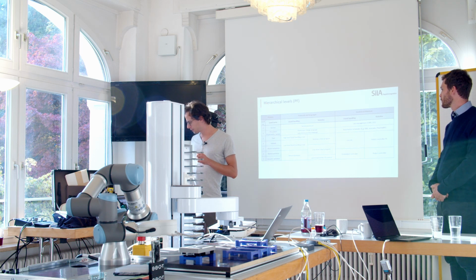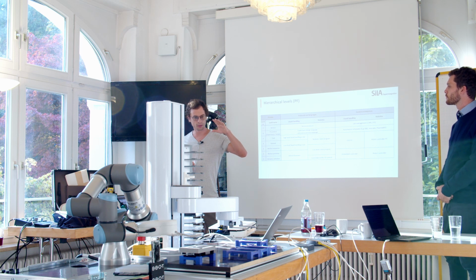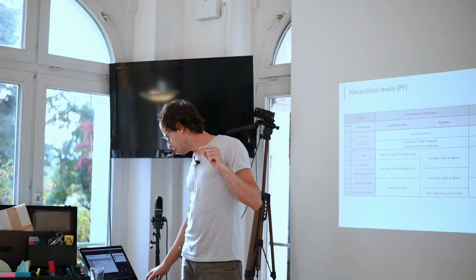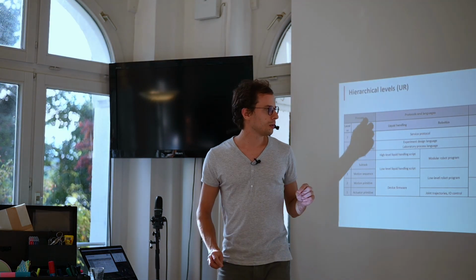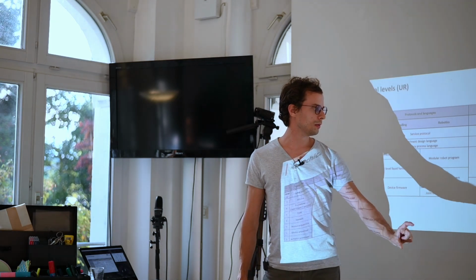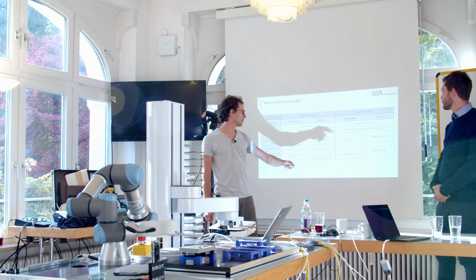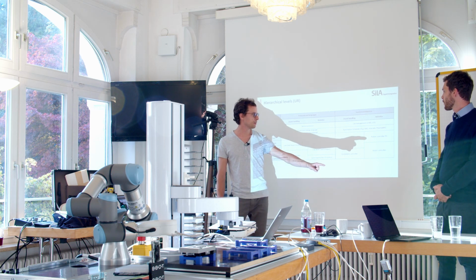And on the next slide, you will see how these commands are communicated with the low-level robot controller. On the other side, for the universal robot, you can see that the role for the robot controller is extended to cover the motion sequences instead of the PC.